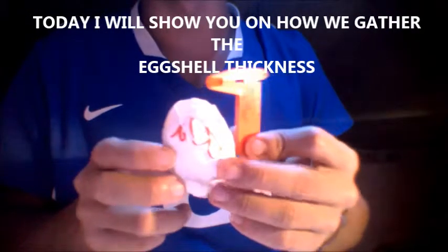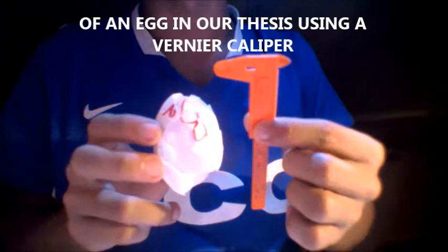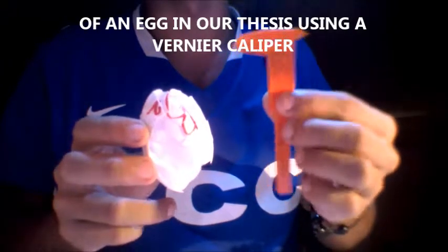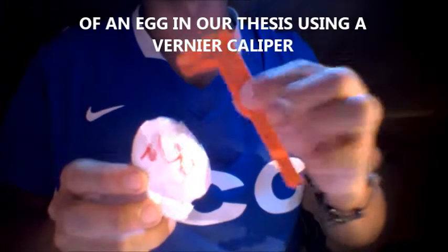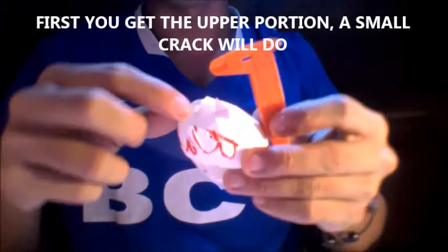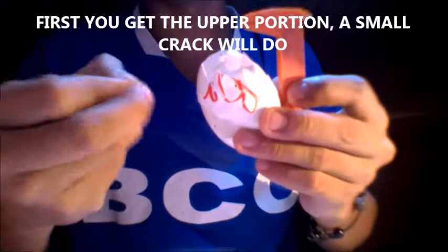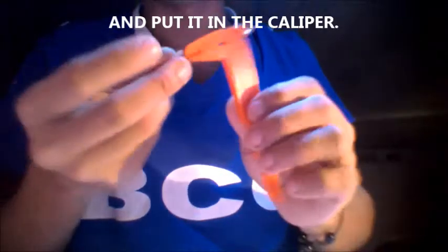Today I will show you how we gather the eggshell thickness of an egg in our thesis using a vernier caliper. First, we get the upper portion — a small crack will do — and put it in the caliper.